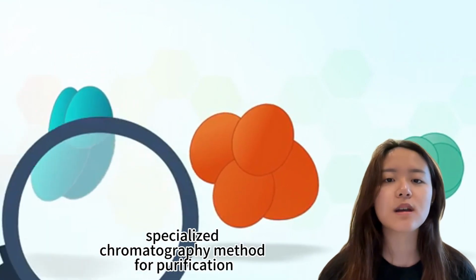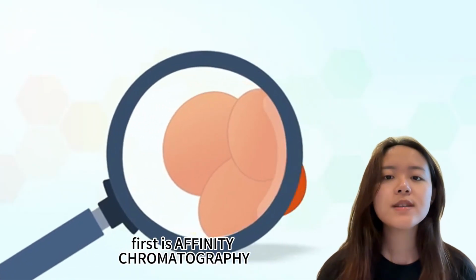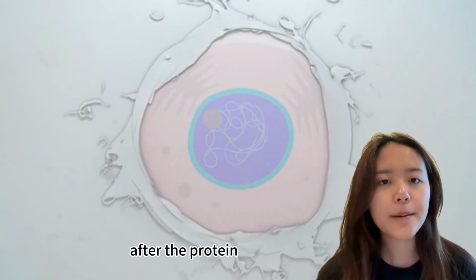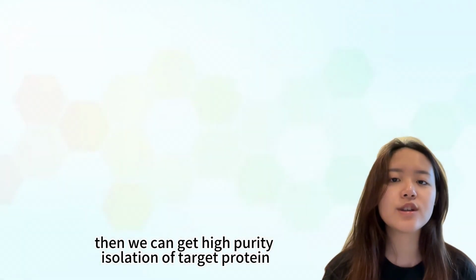We say using specialized chromatography methods for purification, but what are those chromatography methods we can use and what is the difference? First is affinity chromatography. This method separates protein based on specific binding to a ligand. In simple words, we prepare a binding site only for the target protein. After the protein binds to the site, it is released when no other components remain. Then we can get a high purity isolation of the target protein.